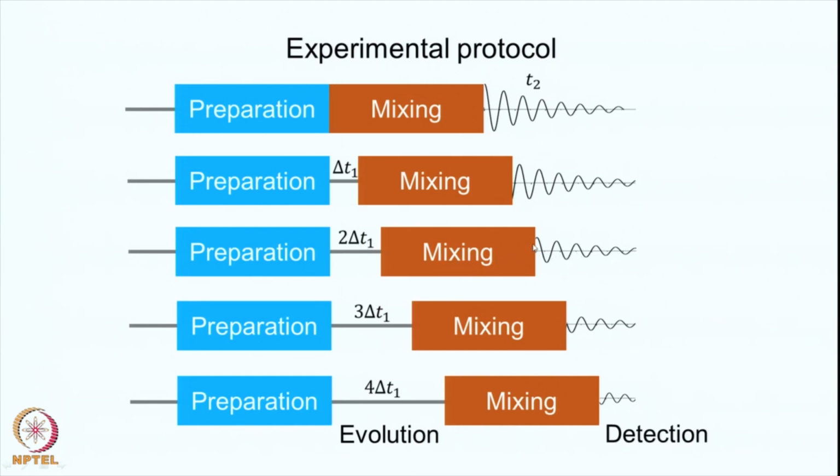Once again, notice the initial time point here is not the same as the initial time point here, and this is actually the crucial part of this experiment. Also, although the FIDs look the same here and here, it may not be the case. It may have more complicated FIDs here, here and here, and we will see that as we go along. Now, you do the third experiment with 3 times delta T1, collect the data as T2, then 4 times delta T1, and so on. You repeat this several times. How many times you do it depends upon the resolution you require in your spectrum.